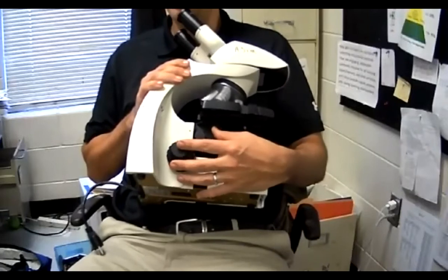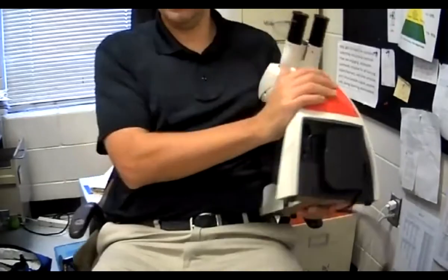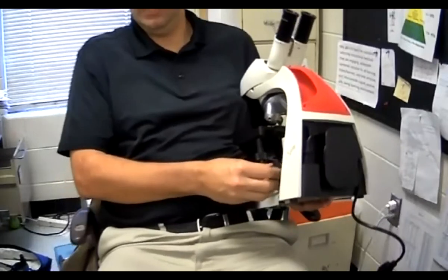The little knob is called the fine adjustment, and it's on both sides. Coarse adjustment is the big knob and the fine adjustment is the little knob.